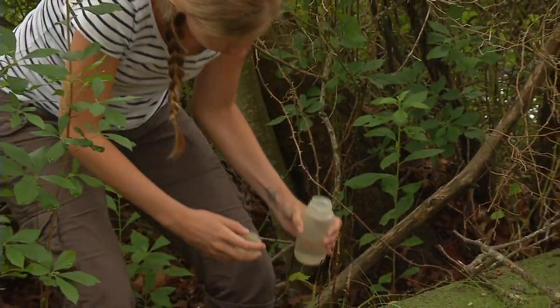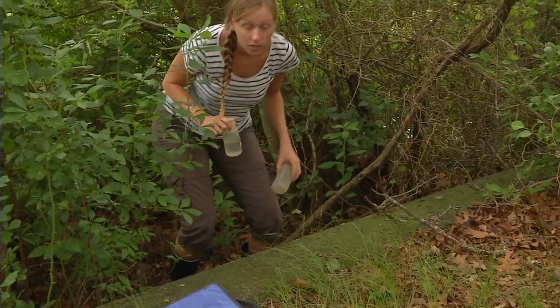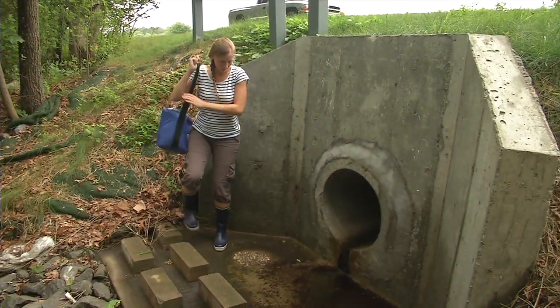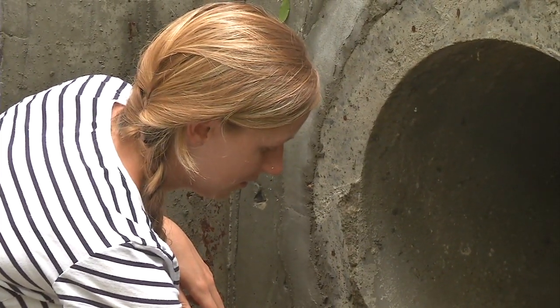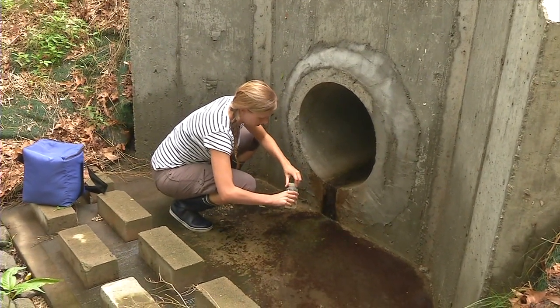What we do with coliform enumeration is measure the amount of a particular pollutant that you're going to find. The enumeration in this case is bacteria, and a lot of what we look at is specifically E. coli bacteria, and that ties into our other major project in the lab, which is the bacterial source tracking. But usually you want to get that baseline just to see where the high levels of pollutants are. That's going to be your bacteria loading, and that's the enumeration, so that we can see where the hot spots are, where there's going to be problems and where there's going to be inputs, so that hopefully we can educate people as far as what's going into the water, how they can affect it, and how they can take part in managing the water that they all use recreationally or even for eating in the case of shellfish.